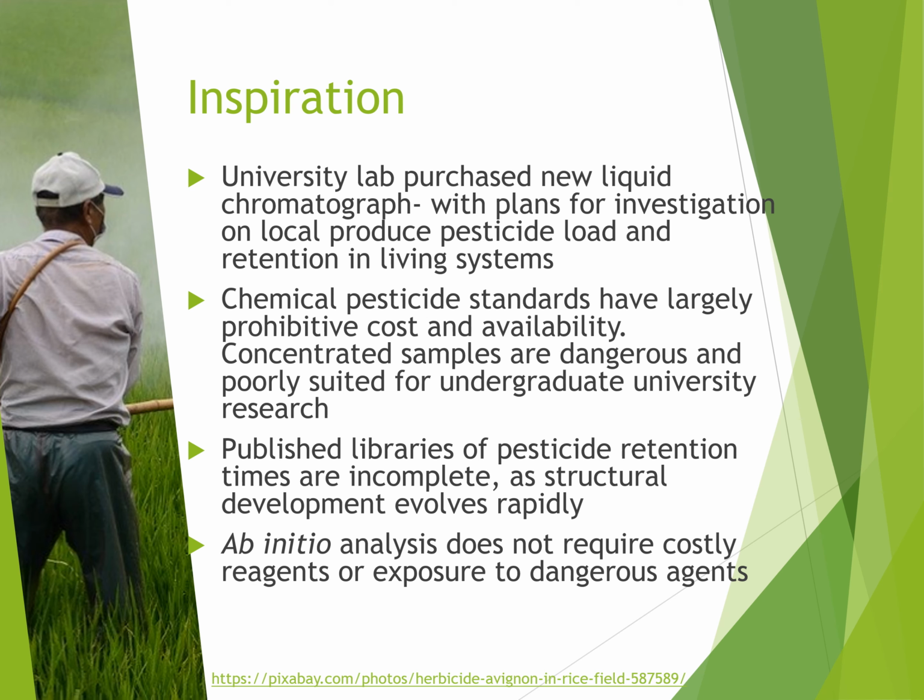My inspiration to pursue this research project began when my university's research lab purchased a new liquid chromatograph. I had been planning an investigation on local produce pesticide load and retention in living systems. While seeking chemical standards to compare fruit samples with, cost and availability of reagents was largely prohibitive. Concentrated pesticide samples tend to have dangerous properties unsuitable for undergraduate university research.